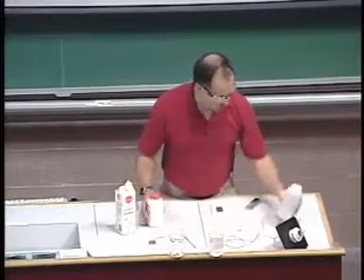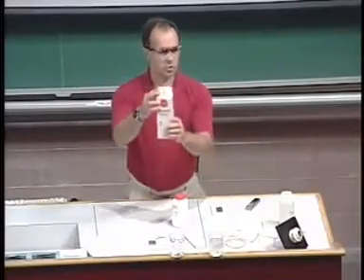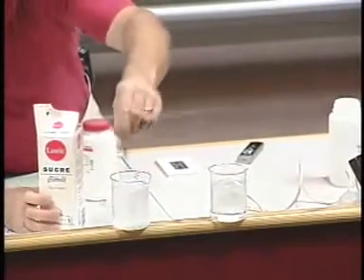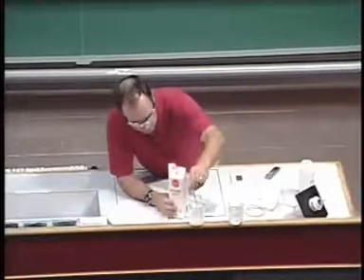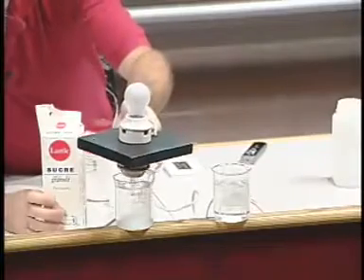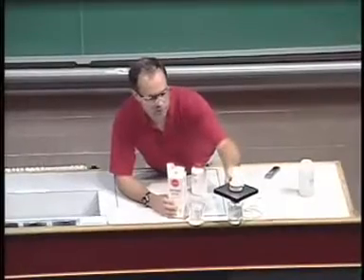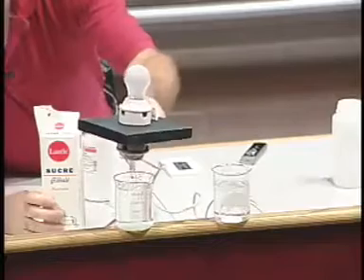Now, does it mean that when we dissolve something, it necessarily conducts electricity? Well, here's some sugar. So I'll throw some sugar in. Stir that around. You know that sugar is fairly soluble in water. I put about the same amount of sugar in there that I had sodium chloride in the other one. So let's see what happens. Zippo. So just because something dissolves in water does not mean that it has separated into ions. The sodium chloride does, the sugar doesn't, but yet it's still soluble. So there's two different things going on in there.